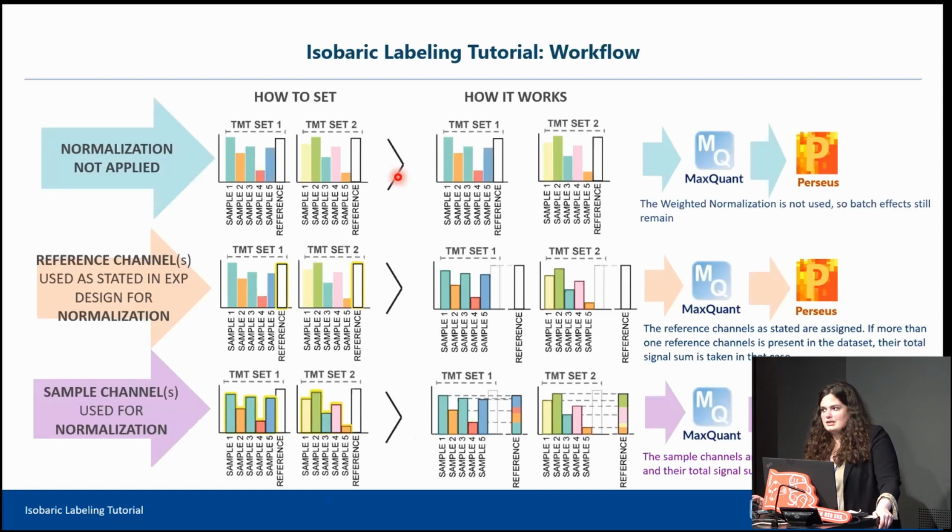These 2 reference channels that are there, I can use for an additional sample instead of using them as a mix, because thanks to this normalization, I can reproduce my in silico reference without a reference already defined during the sample preparation.